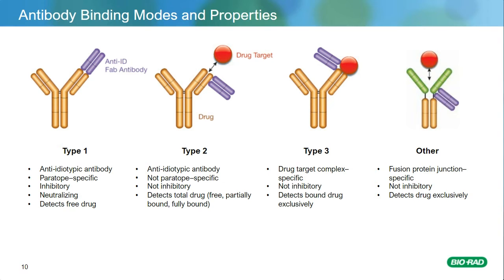So for example, the drug antibody can often exist in the free form, but if the target of the drug antibody is present in the serum, for example, if it's a receptor that is shed into the serum, or if it's a serum protein, your analyte, your therapeutic drug antibody, can exist in complex with its target, and so won't be present in the free form necessarily, or not entirely present in the free form.